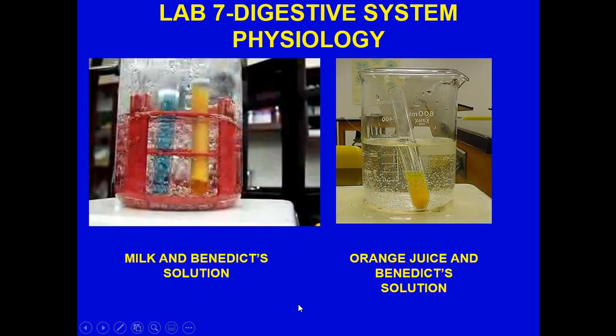Now, what they did in the experiments is you didn't find any starch in it. So they took these different types of solutions and put them up to the Benedict solution test. Benedict's solution reacts in a water bath with whatever materials are present.